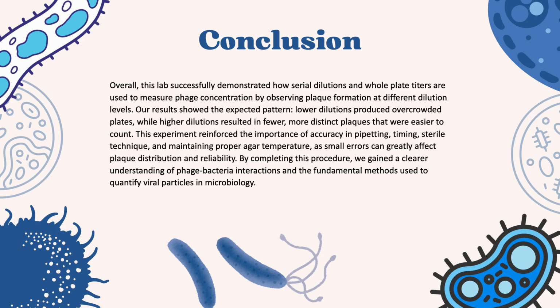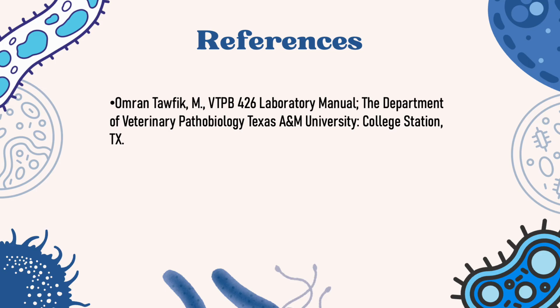This experiment reinforced the importance of accuracy in pipetting, timing, sterile technique, and maintaining proper agar temperature, as small errors can greatly affect plaque distribution and reliability. By completing this procedure, we gained a clearer understanding of phage bacterial interactions and the fundamental methods used to quantify viral particles in microbiology. For our references, we did use the laboratory manuals and the lab instructions provided by Dr.